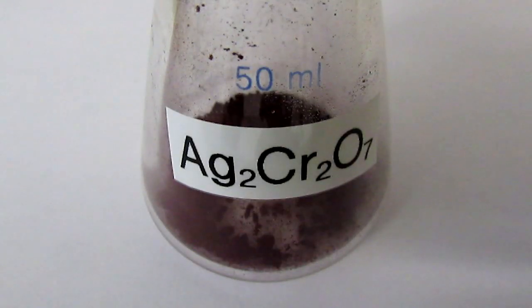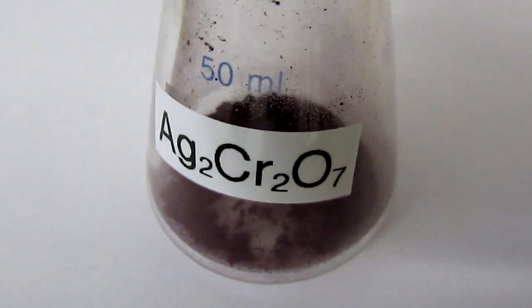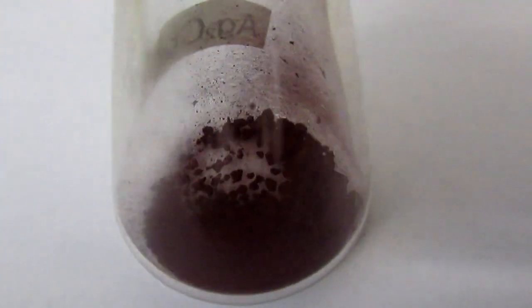Here's some of the silver dichromate I made earlier in the video. It takes on a very dark red, almost brownish color after drying. This is what the silver dichromate looks like after being dried and left in this vial for a day — you can see it still retains its dark red color.